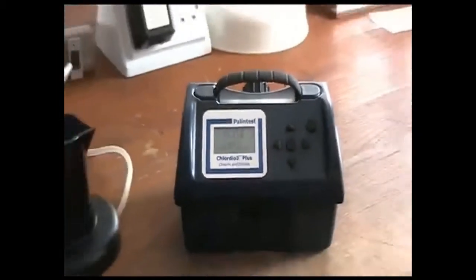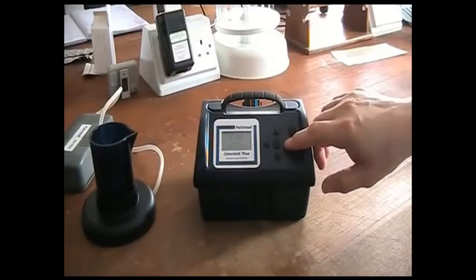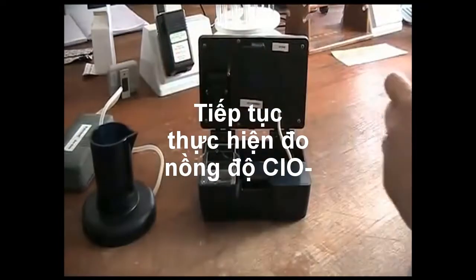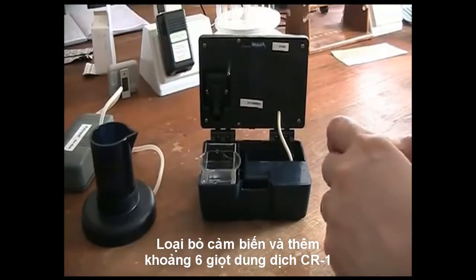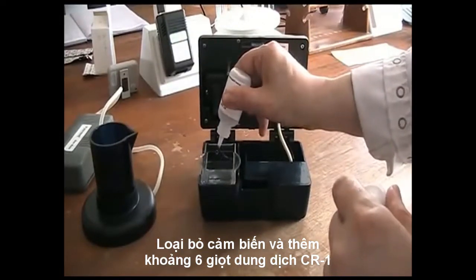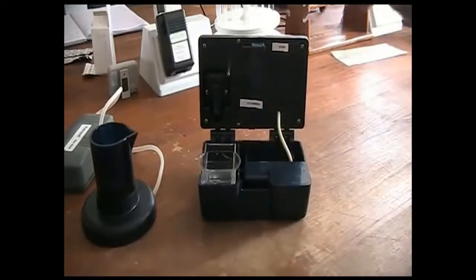Again, you can terminate the method here or step onto measure chlorite. Measuring chlorite is a 2-stage process. Remove the CS sensor, but retain the sample. Add 6 drops of CR1 reagent and gently stir.